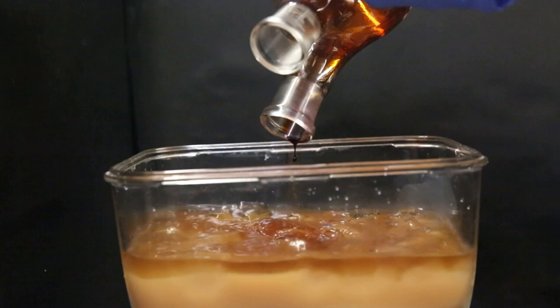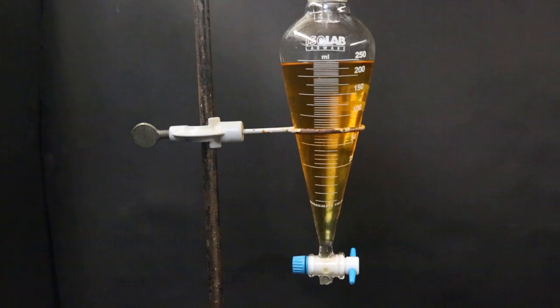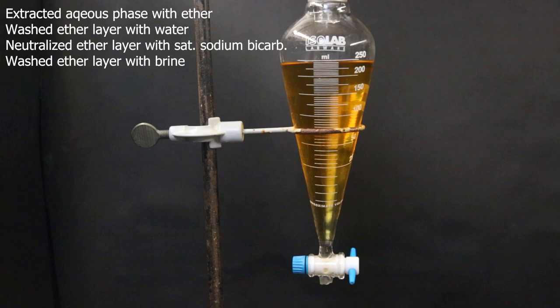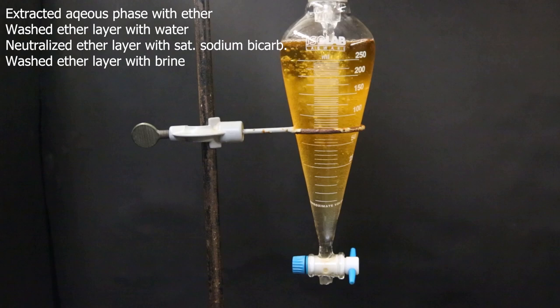Then I set up a large beaker with a funnel and transferred all of the contents into it. Then I moved it in parts to the separatory funnel and separated the water and the ether layer. Then I extracted the water layer with ether, washed the ether layer with some water to wash out the bulk of the acid, and then I neutralized the ether layer with a saturated sodium bicarbonate solution. And finally I washed it with some brine.